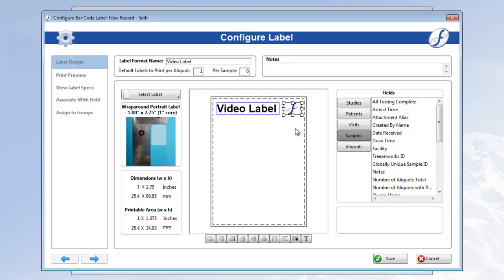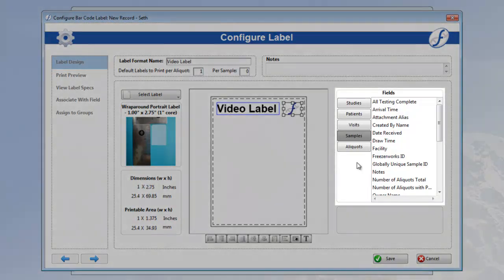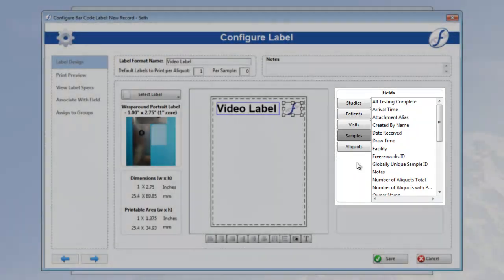Now we need to add the actual data that will be appearing on the format. On the right side, you'll see the standard list of fields, separated by a related inventory table. Currently we are looking at samples fields. If I click the aliquots button, we're looking at aliquots fields.